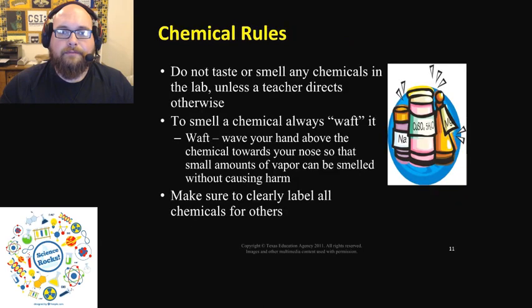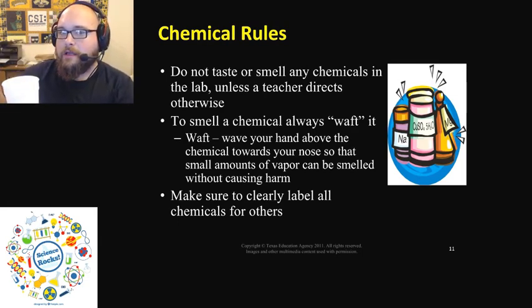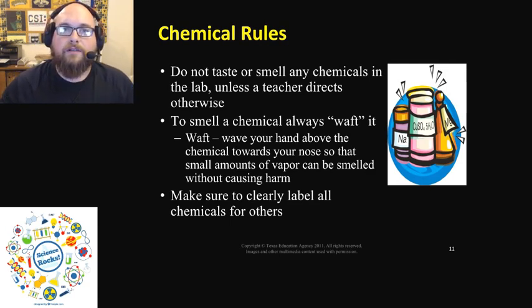So, some chemical rules: do not taste or smell any chemicals in the lab unless you are directed to do so. We are going to waft things towards our nose by taking our container and taking our hand and pushing the air towards our nose. This is wafting. This keeps our sense of smell safe, but we can still observe the odor.